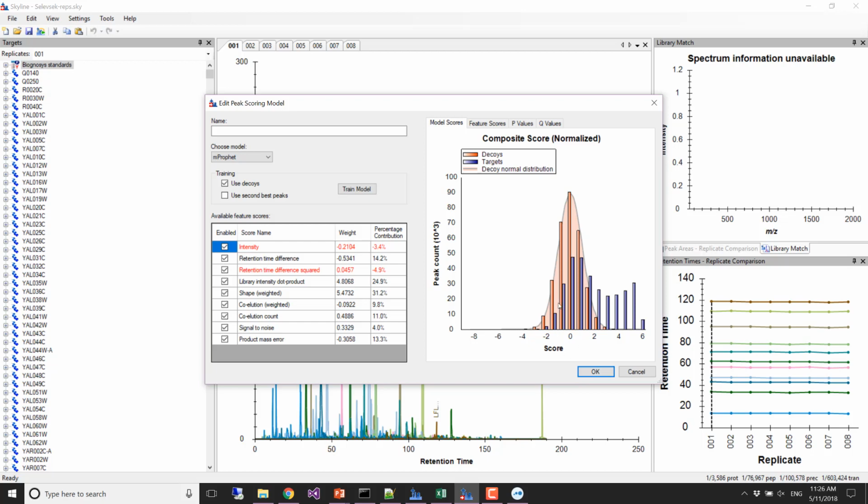We've mostly been dealing with things where we use DDA to pre-select things that we thought we could detect, and then we go back and say, can we detect them with DIA? And yep, sure we can. That's great news. But this is a case where we used a lot of other sample preparation to ask what could possibly be detected in this yeast with a mass spectrometer.